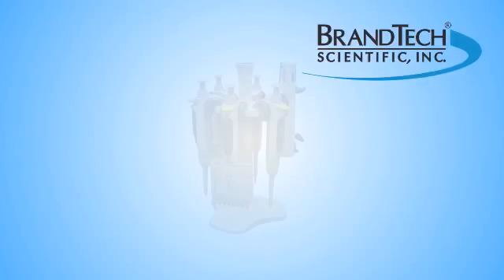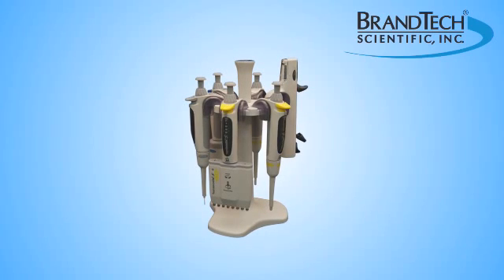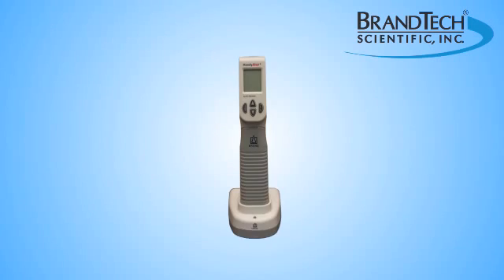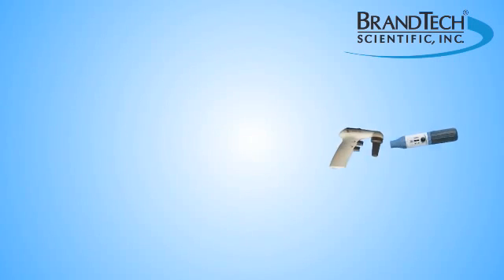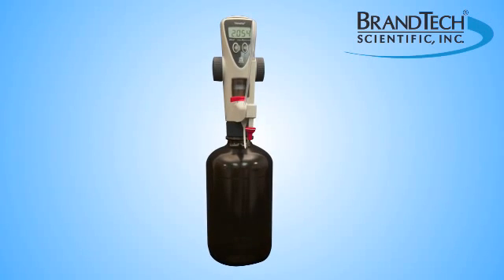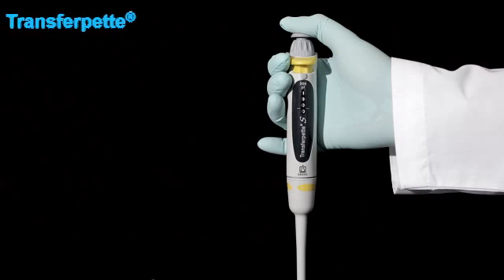Brantek Scientific offers a full line of liquid handling products including single and multi-channel pipettes, repeating pipettes, pipette controllers, bottle top dispensers, and bottle top burets. Today we will explore our TransferPet S Pipettes.